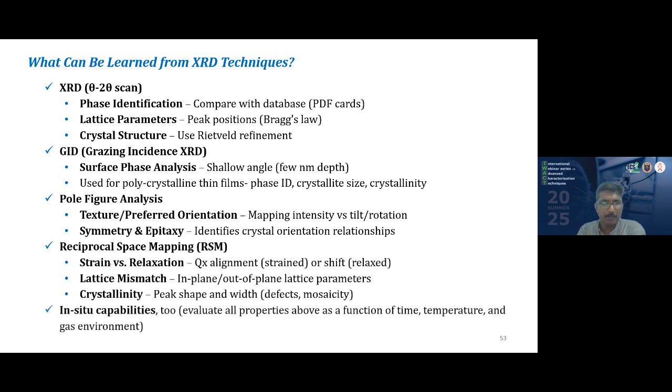In addition to that, we can also do in situ measurements, like evaluating the X-ray diffraction as a function of time, temperature, and gas environments. So the X-ray diffraction technique plays a critical role in the characterization of thin films and nanostructured materials.